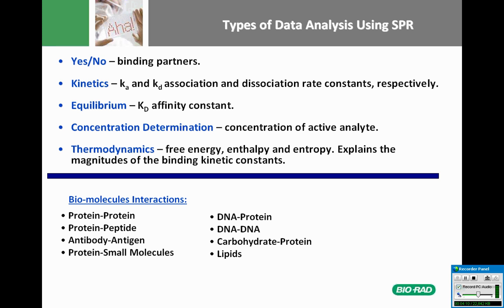So basically, you can measure the interaction of any biomolecule of interest: proteins, peptides, antibodies binding to antigens, proteins with small molecules, DNA binding to proteins, DNA-DNA interactions, and whatever is considered a biomolecule, you are welcome to test and try if it binds to its partner.